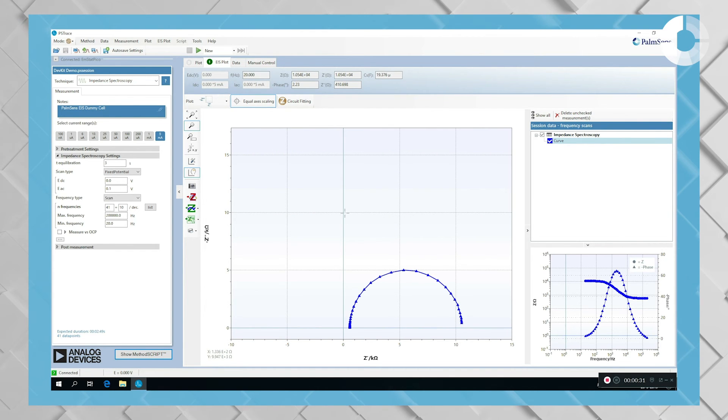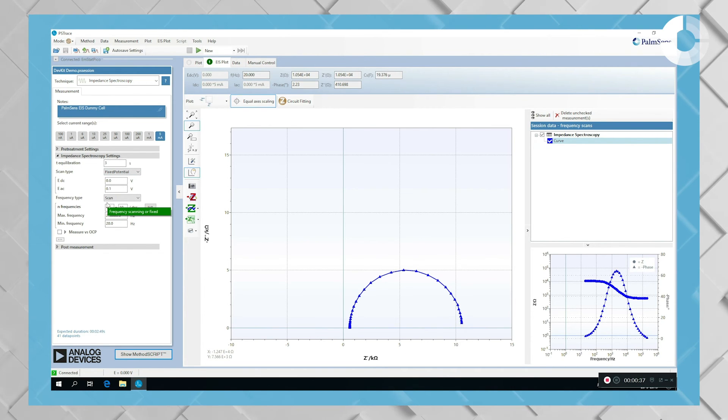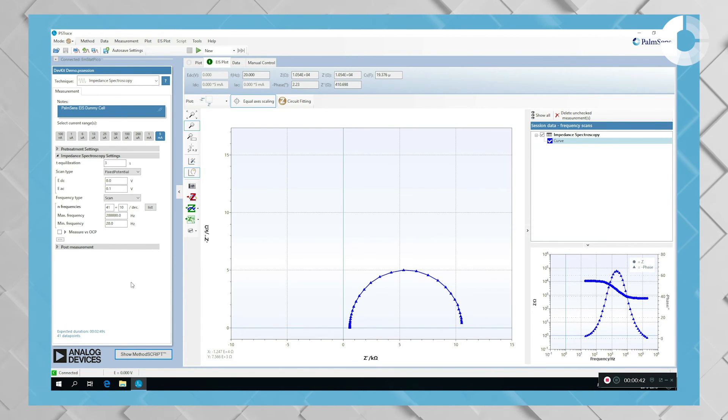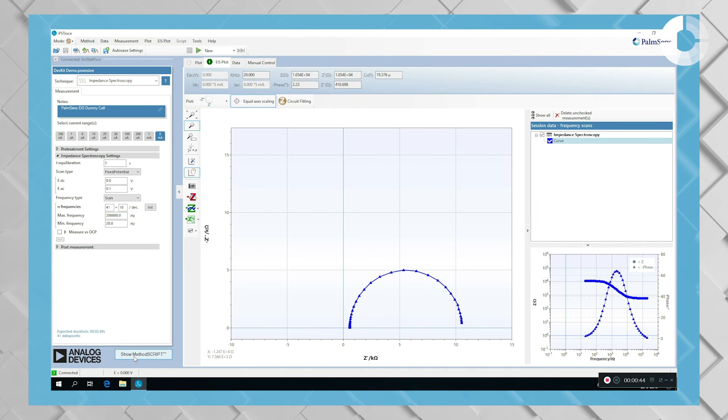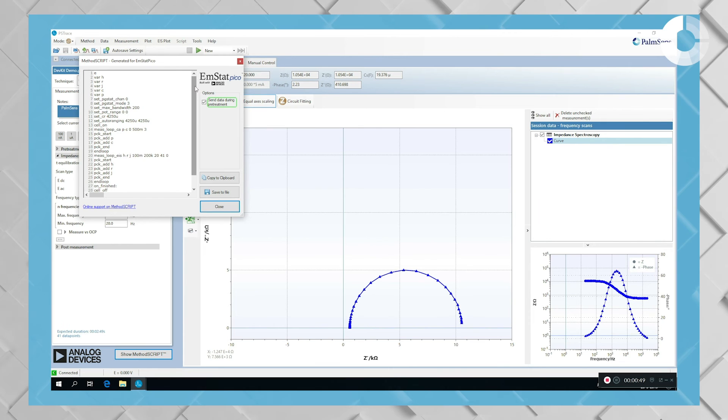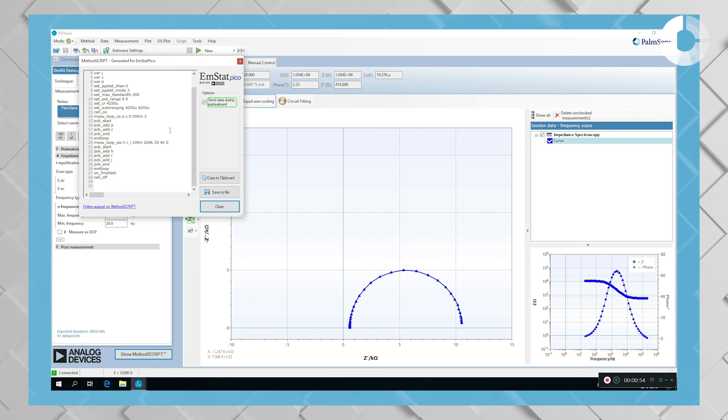If you want to perform exactly the same method with your own software that you have programmed for your project, you can do that easily by pressing the show method script button. And this way you see the code that was sent to the Amstead Pico to perform this measurement.